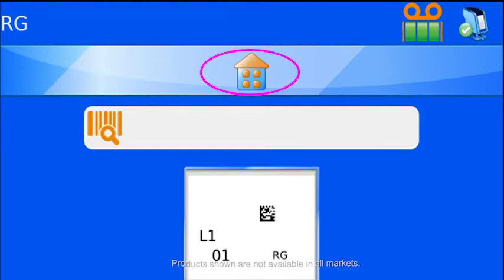The new home button can be used to quickly return to the print screen or to log out of the system.